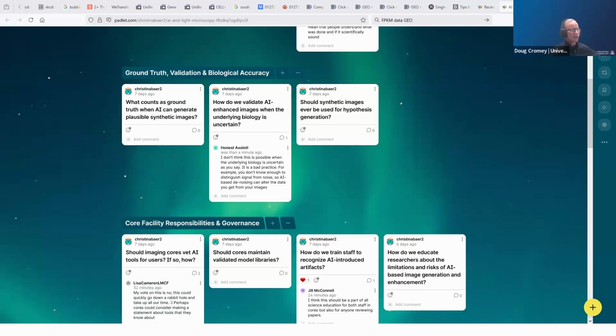Well, I was just going to say, when we're doing image analysis, at least classically in the past, the assumption was there's probably at least a 5% or 10% amount of error built in, because a human did the selection, or inter-operator error and things like that. So people would tell me, yeah, we had this really small difference, and it's like, that's probably noise. But yeah, I agree with Bill. If we can't necessarily know exactly what we're going to get out every single time, we're in trouble.